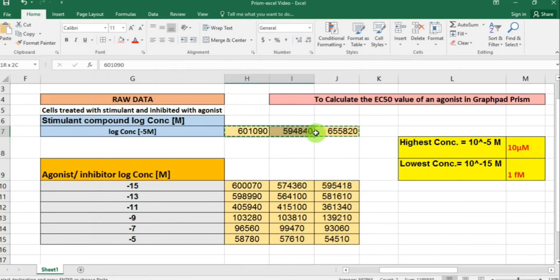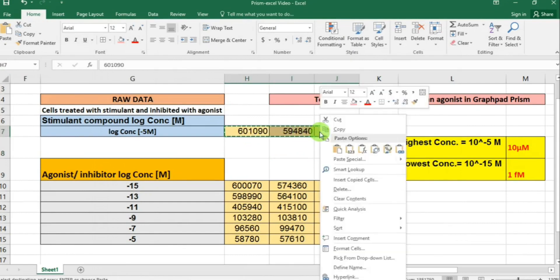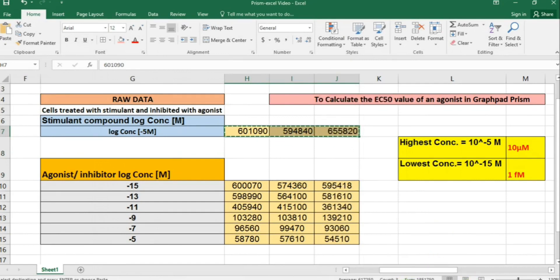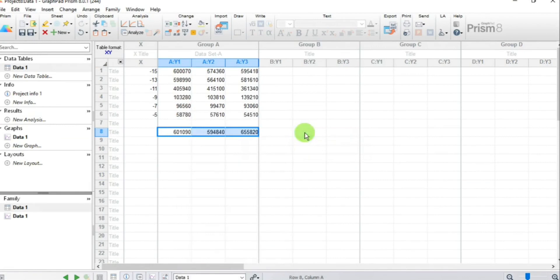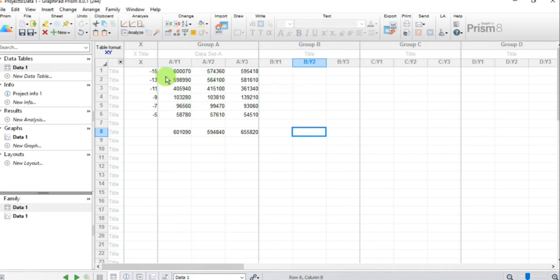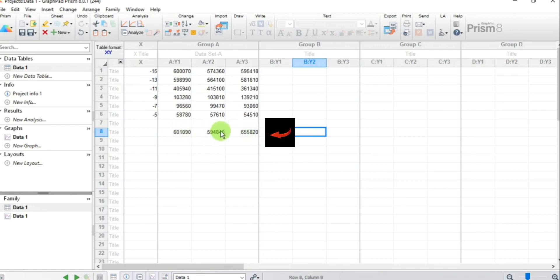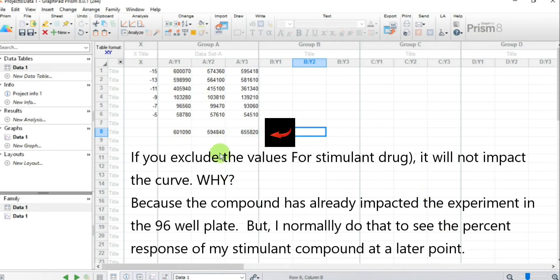Select and copy the stimulant values, go back to Prism, and paste them. Now I have all my data on the Prism sheet: the X values or log concentrations, the responses from the agonist, and the three values for the stimulant drug.